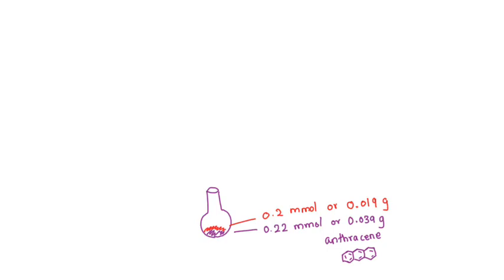It's very hard to weigh this small amount. Okay, so this is the maleic anhydride. Now, which one do you think is the limiting reactant? Have you studied the limiting reactant? Okay, let's talk about this a little bit.